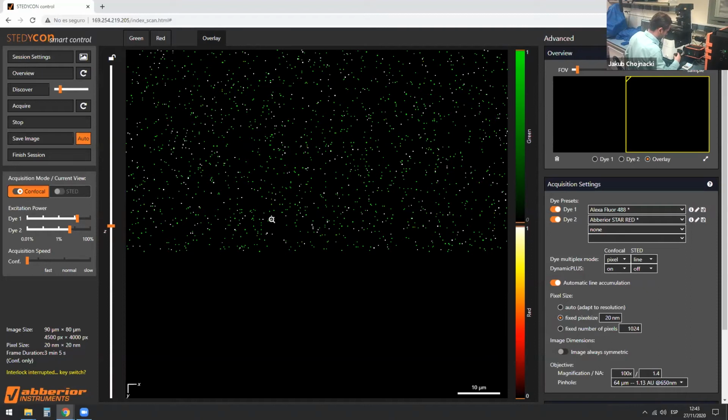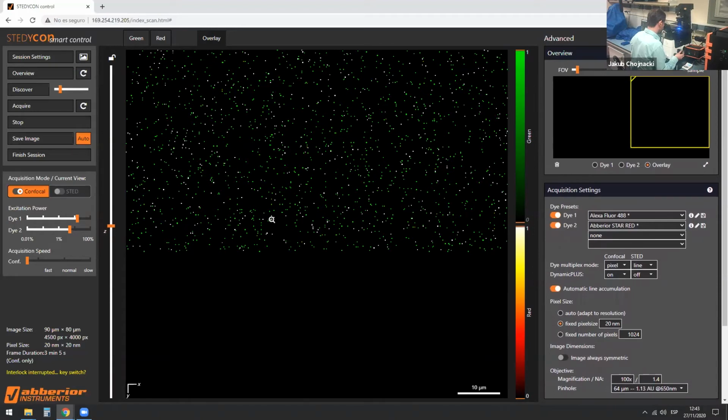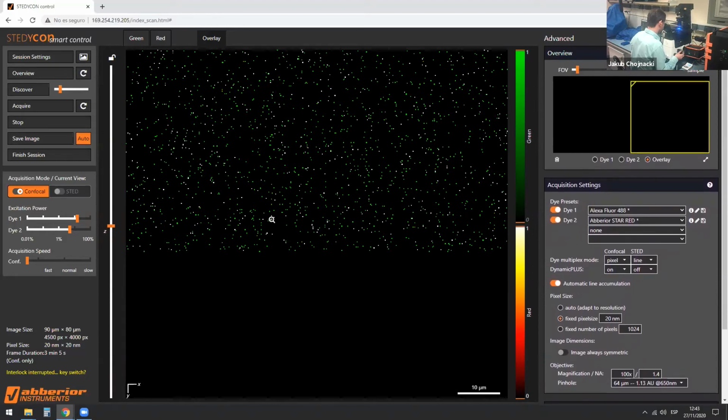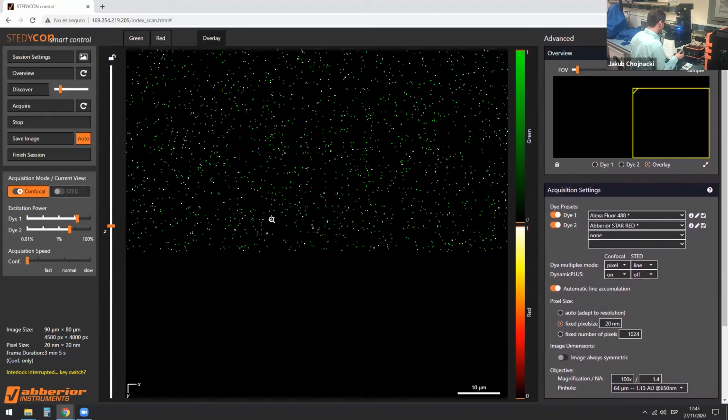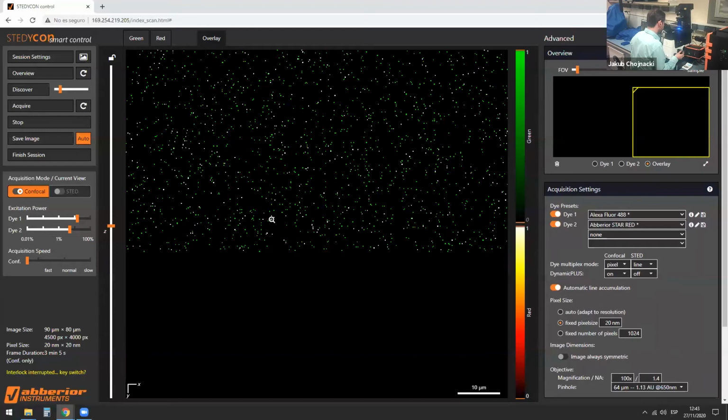So let's switch here excitation light. Unfortunately, this bit you cannot see, but I see a lot of viruses on the surface. Let me find a good spot where there are not that many virus particles, because there are literally millions and millions of virus particles present on the surface here. Okay, let's look at this area, for example, here. I don't know if it's good, but all right.